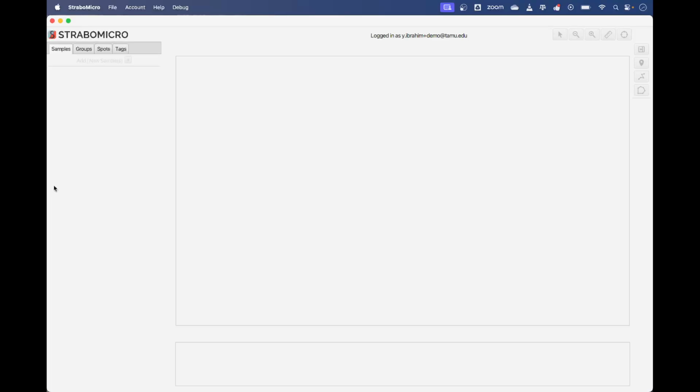Hey everyone, in this video I'll show you how to create a project and import a sample into StraboMicro. So the first thing we want to do is head over to File up here at the top, and we have two options. We can either import a new project or import a project from field data.